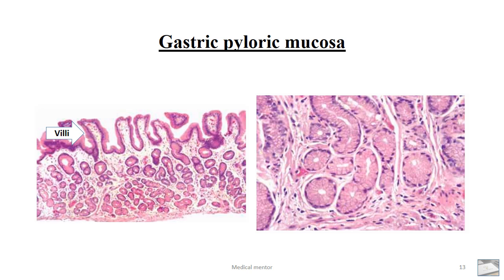This figure shows the gastric pyloric mucosa. The pyloric glands are composed of mucus-secreting cells with abundant clear cytoplasm. The cardiac mucosa and the pyloric mucosa look alike structurally, but the difference between them is: number one, the pyloric glands secrete neutral mucin only, whereas the cardiac glands secrete both neutral and acidic mucin. Additionally, the pyloric mucosa has gastrin immunohistochemical stains that highlight a band of G cells, whereas the cardiac mucosa lacks the gastric gastrin immunohistochemical stains.